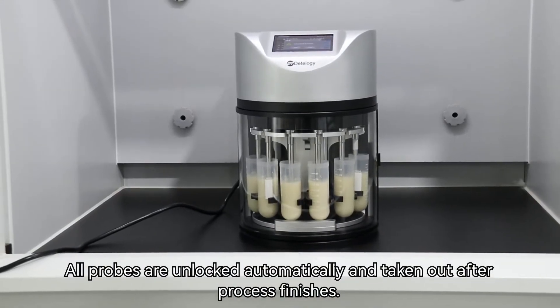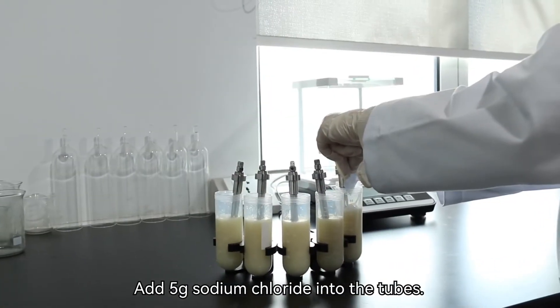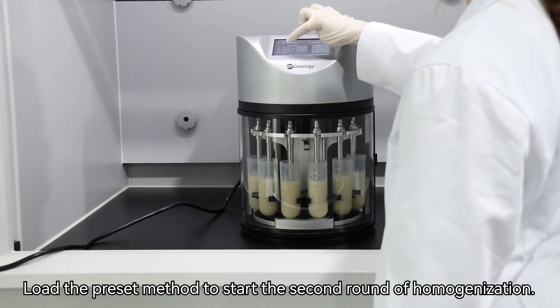All probes are unlocked automatically and taken out after the process finishes. Add 5 grams sodium chloride into the tubes. Load the preset method to start the second round of homogenization.